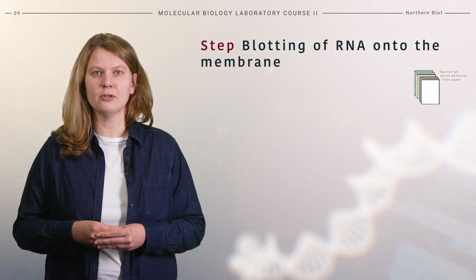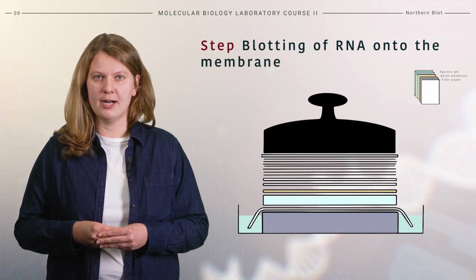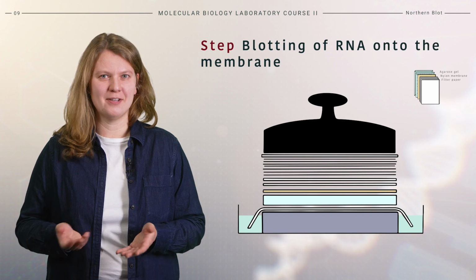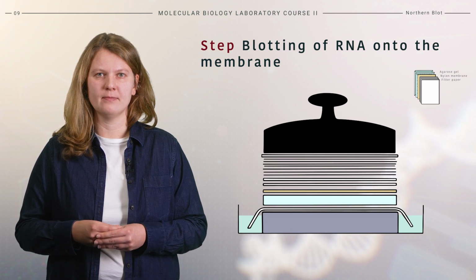Further on, we continue with the step of capillary transfer. During this step, negatively charged RNA is transferred to a positively charged nylon membrane. This is facilitated by capillary transfer. The usual structure of the blot is depicted in the scheme.